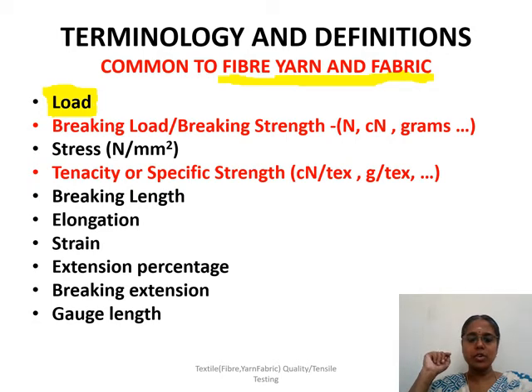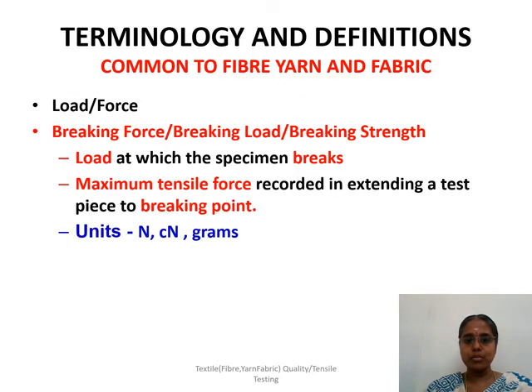Then we will see what is tenacity, the other terms: breaking length, elongation, strain, extension percentage, breaking extension, gauge length, and many other terms. I want you to read the other terms as well in the book. We will go through a few terminologies and how you find them.